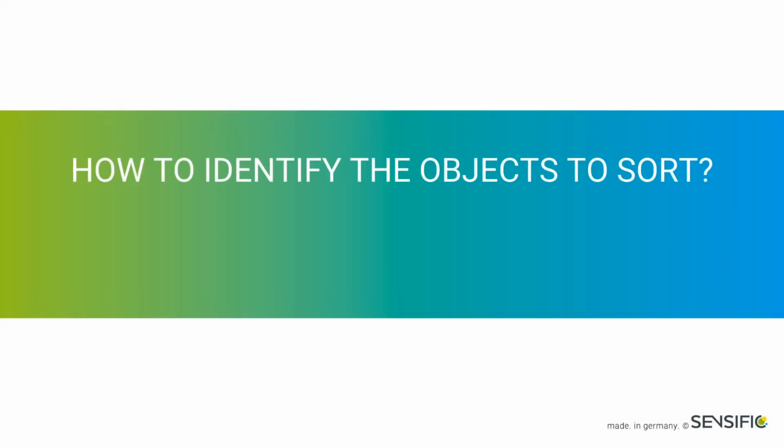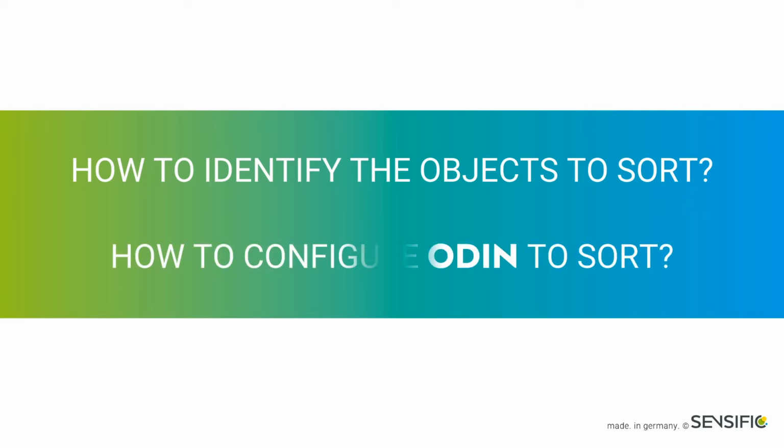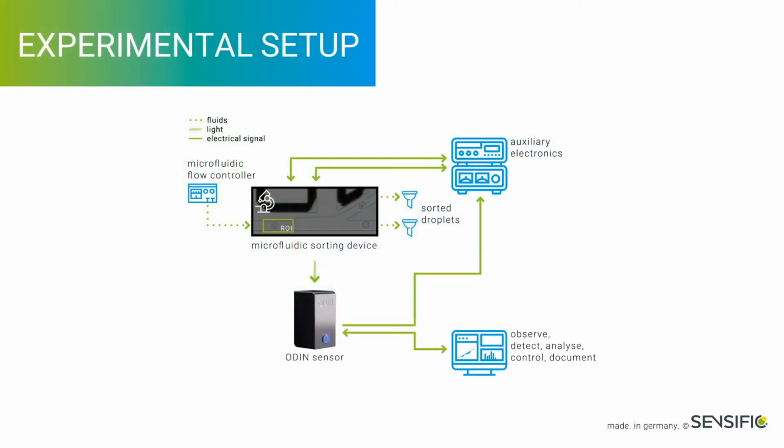In this video, I'll show you how to identify objects to sort in the built-in analysis interface of ODIN, and how to configure ODIN such that it will trigger the sorting device properly. Let's have a look at the experimental setup.